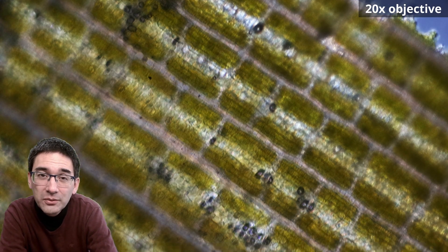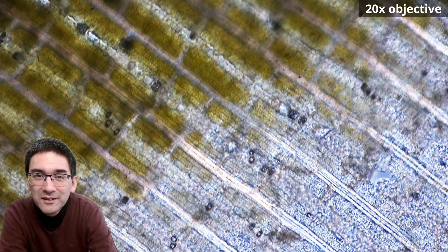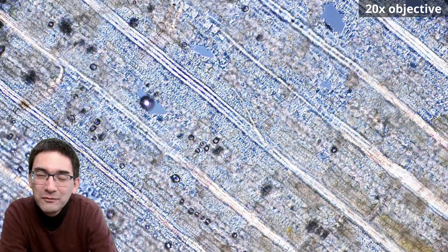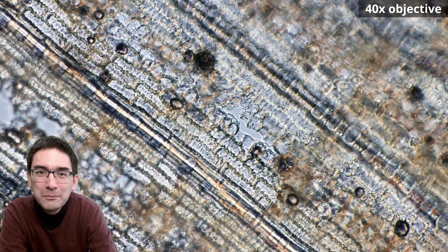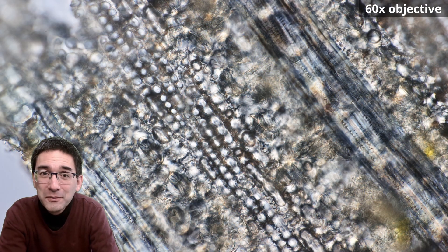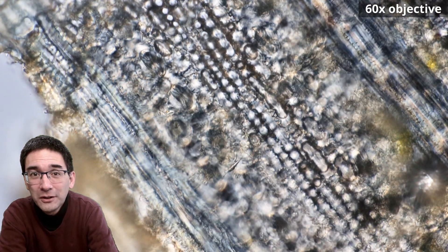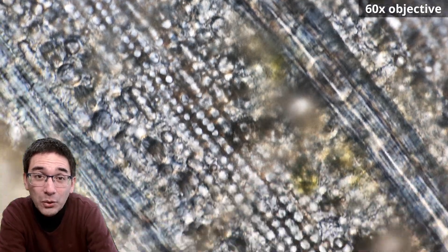Here you still see a lot of chloroplasts — it's still quite thick — but as I move over you can see the leaf starts to become more and more transparent. Over here, if you look very carefully, you're able to see the individual cells. You'll see that the cell walls are not straight but squiggly — the cells have these wavy lines where they connect to each other. I don't know why this is the case; maybe it strengthens the leaf a little bit. Some of the cells are also a little bit rounder, but in any case this new method seems to work quite well.